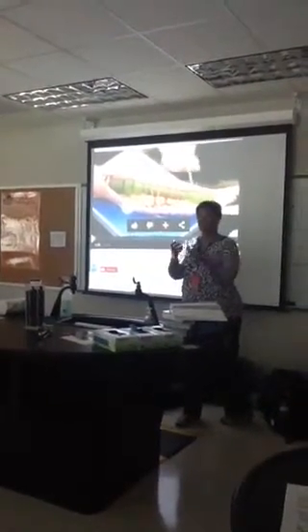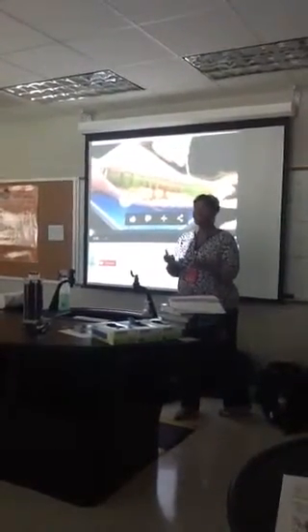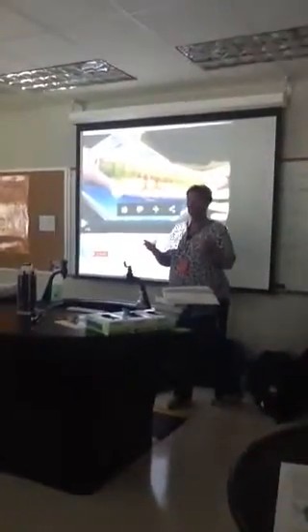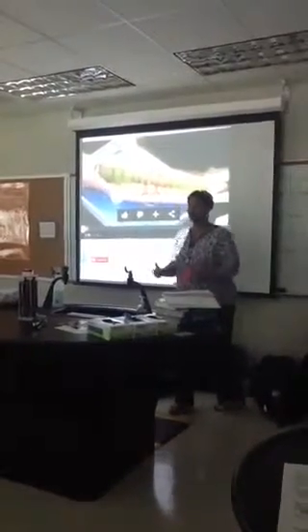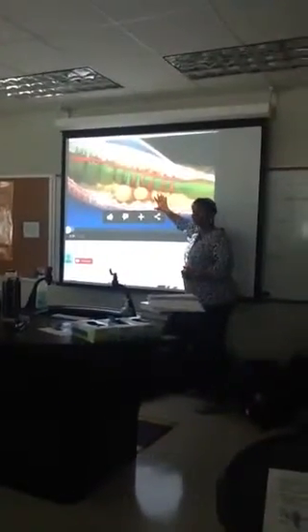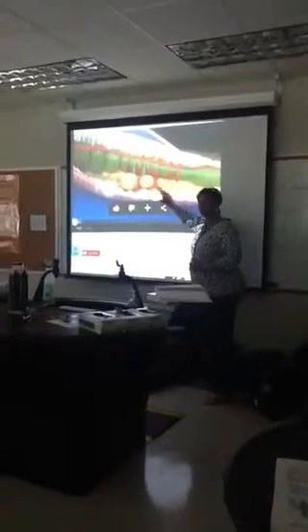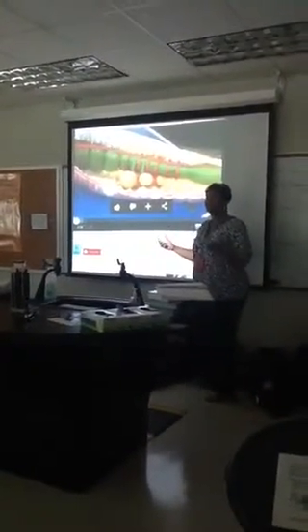Yeah, so you're going to hear that cracking, you're going to hear that popping. Why? Because you can't hurt them, guys. They are already dead. So this particular lab is for exploring. When you pull back parts of the actual anatomy of your specimens, it is okay. If you go into a YouTube video, you can see what other classes have done and are going to do, just like you are in your biology classes. So you won't be intimidated by what you're doing.